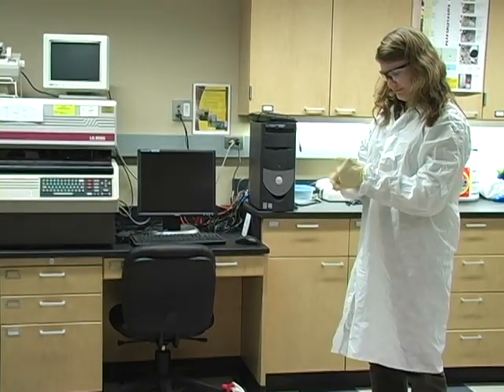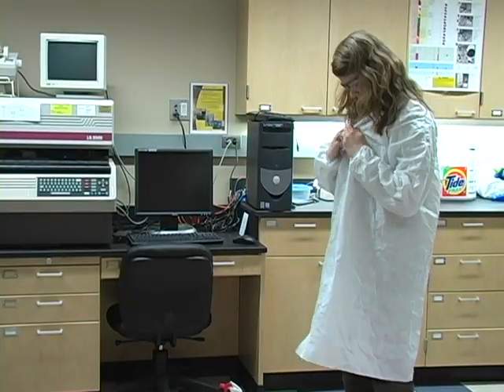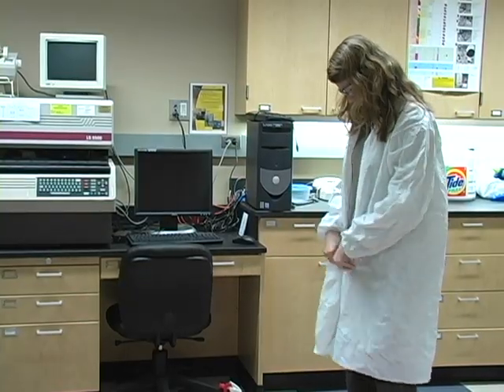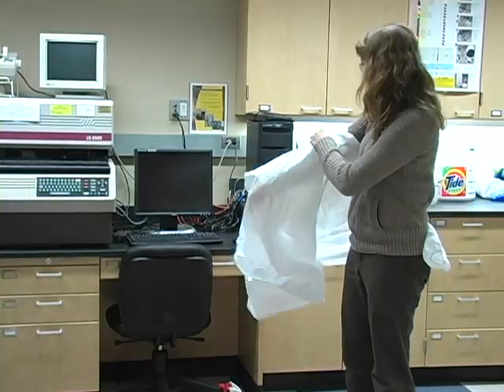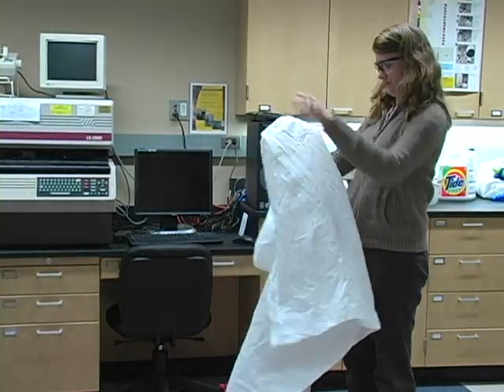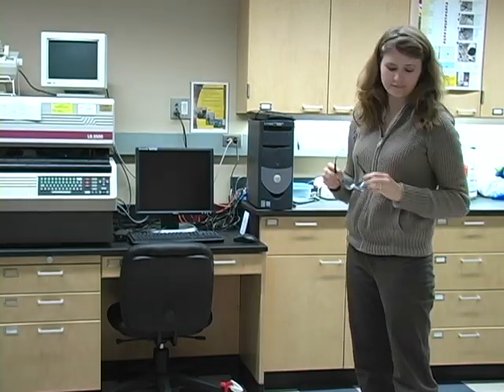Remove PPE, starting with gloves, then the lab coat, and then eye protection. If your hands become contaminated in the process, be sure to wash them before removing another piece of PPE. And lastly, wash your hands one more time after all PPE is removed.